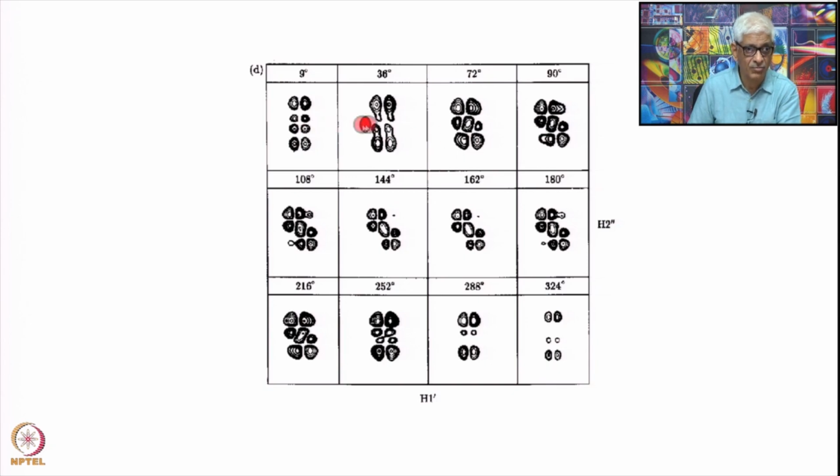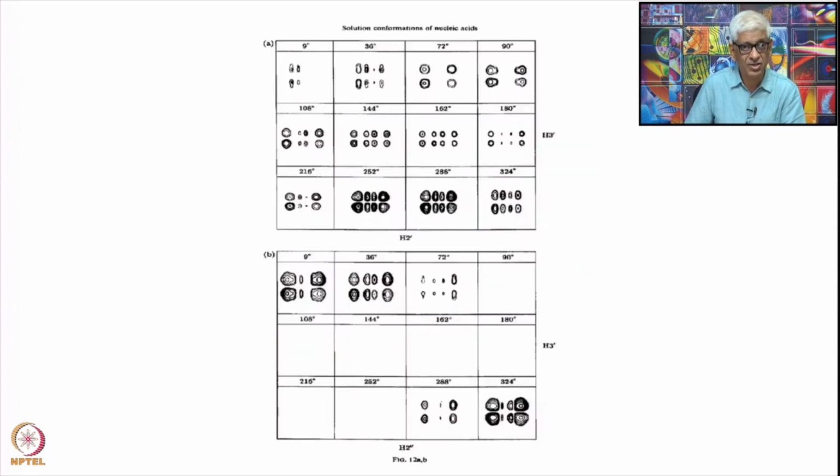This one is a little bit more complex, but here it becomes much clearer with regard to the components which are present. This becomes similar to this one here, and the C2' endo geometry is very well characterized by this fine structure. You can clearly see 4 here and 4 there, and these will be the plus minus, and then you have the plus minus here, and these are extremely useful for calculating the coupling constants. I will demonstrate this to you in certain other things. Similarly, this one is now for the 2' 3' and 2" 3' peaks. These are for the 2' 3' peak, and these are for the 2" 3' cross peaks.